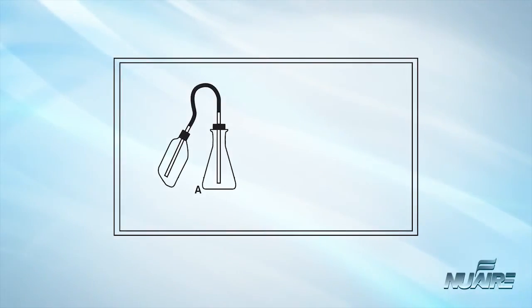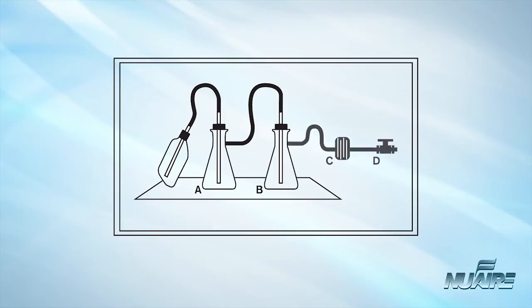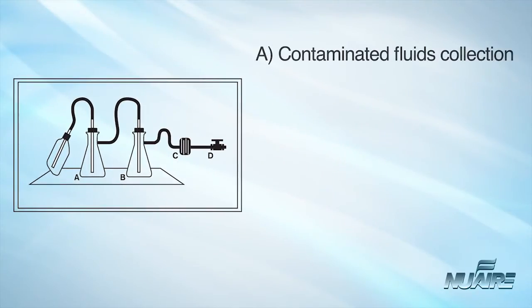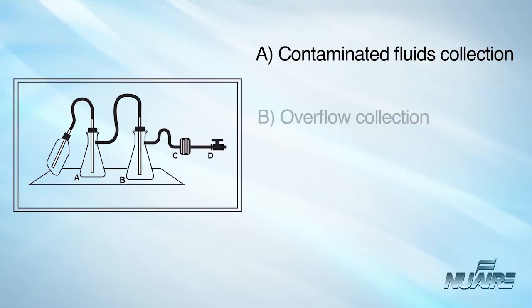Aspirator bottles or suction flasks should be connected to an overflow collection flask containing appropriate disinfectant and to an in-line HEPA or equivalent filter. The left suction flask, A, is used to collect the contaminated fluids into a suitable decontamination solution. The right flask, B, serves as a fluid overflow collection vessel.